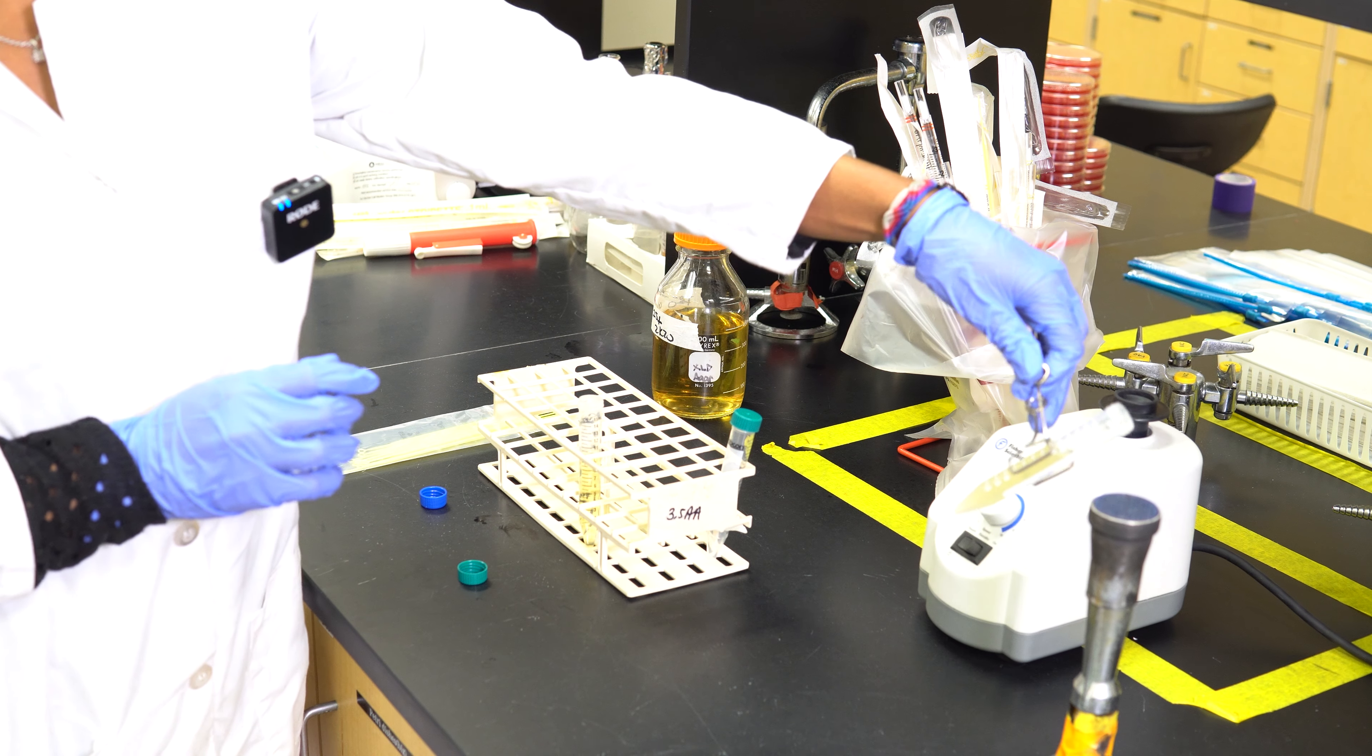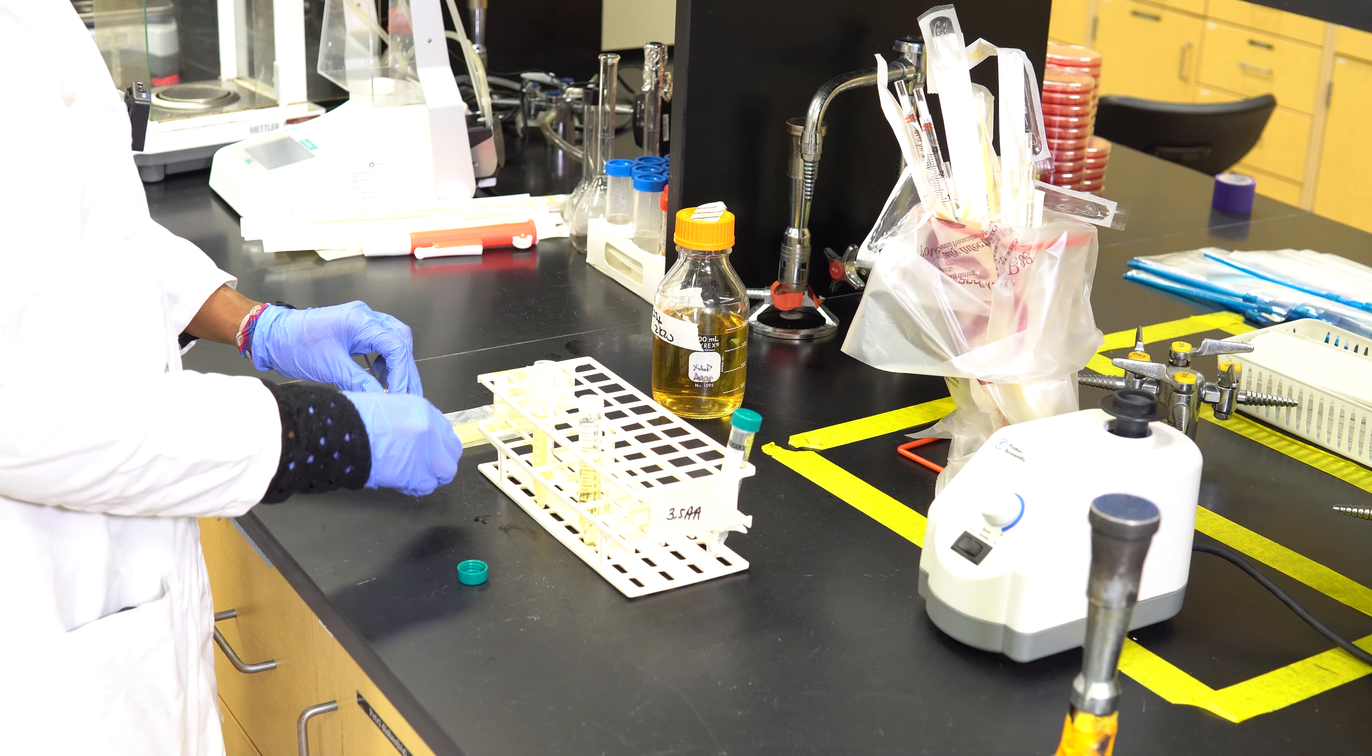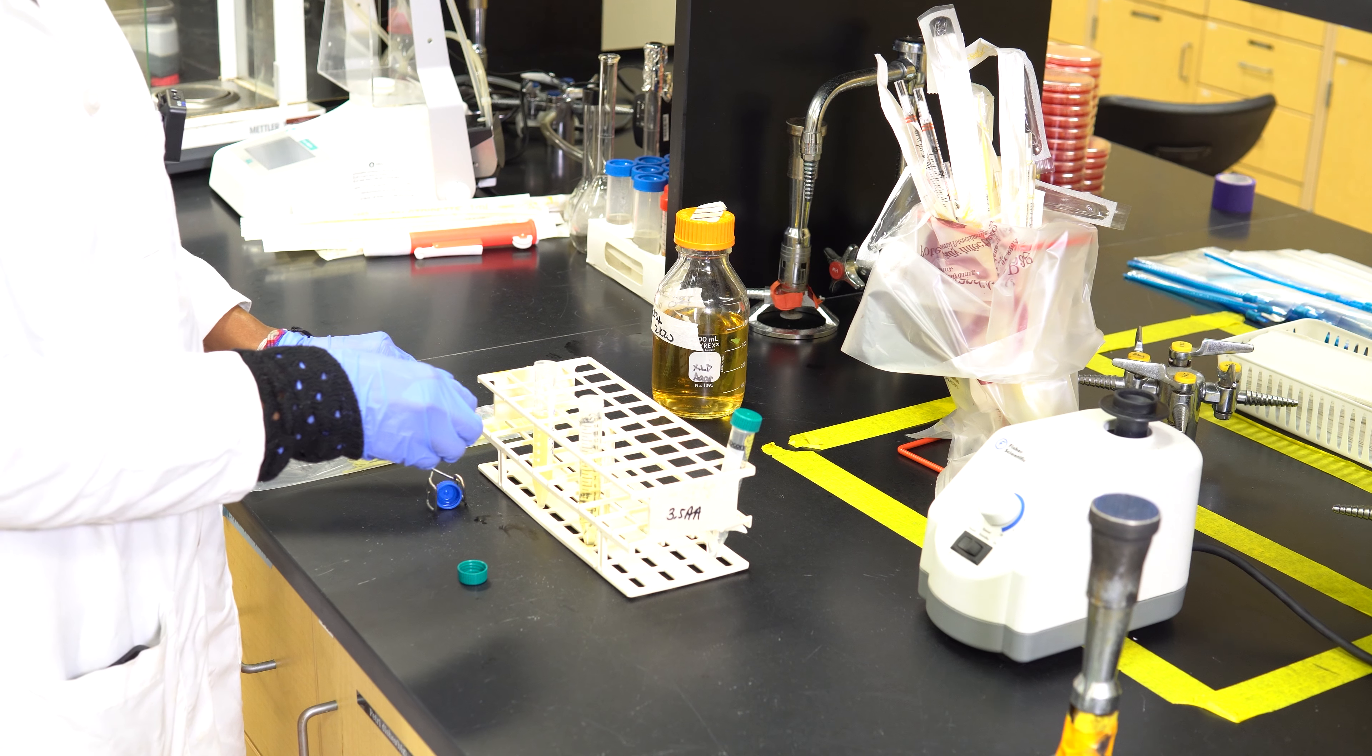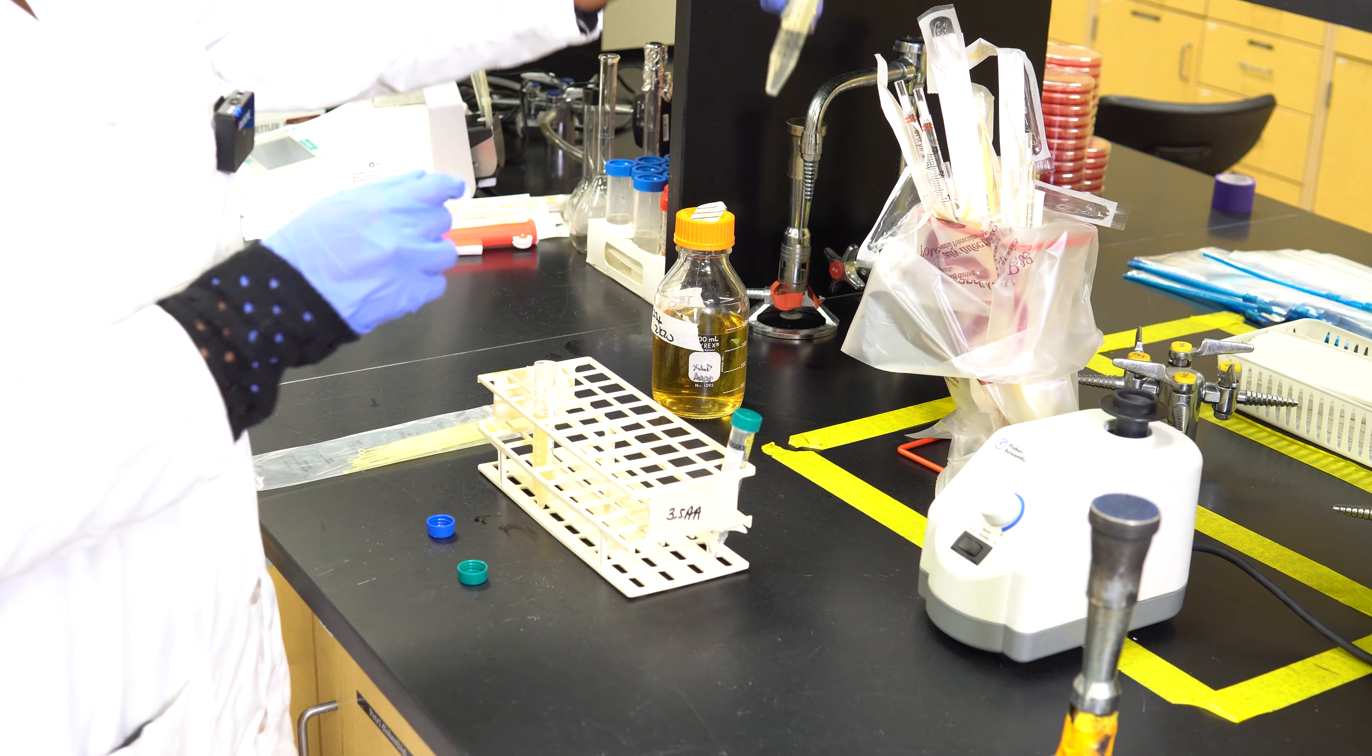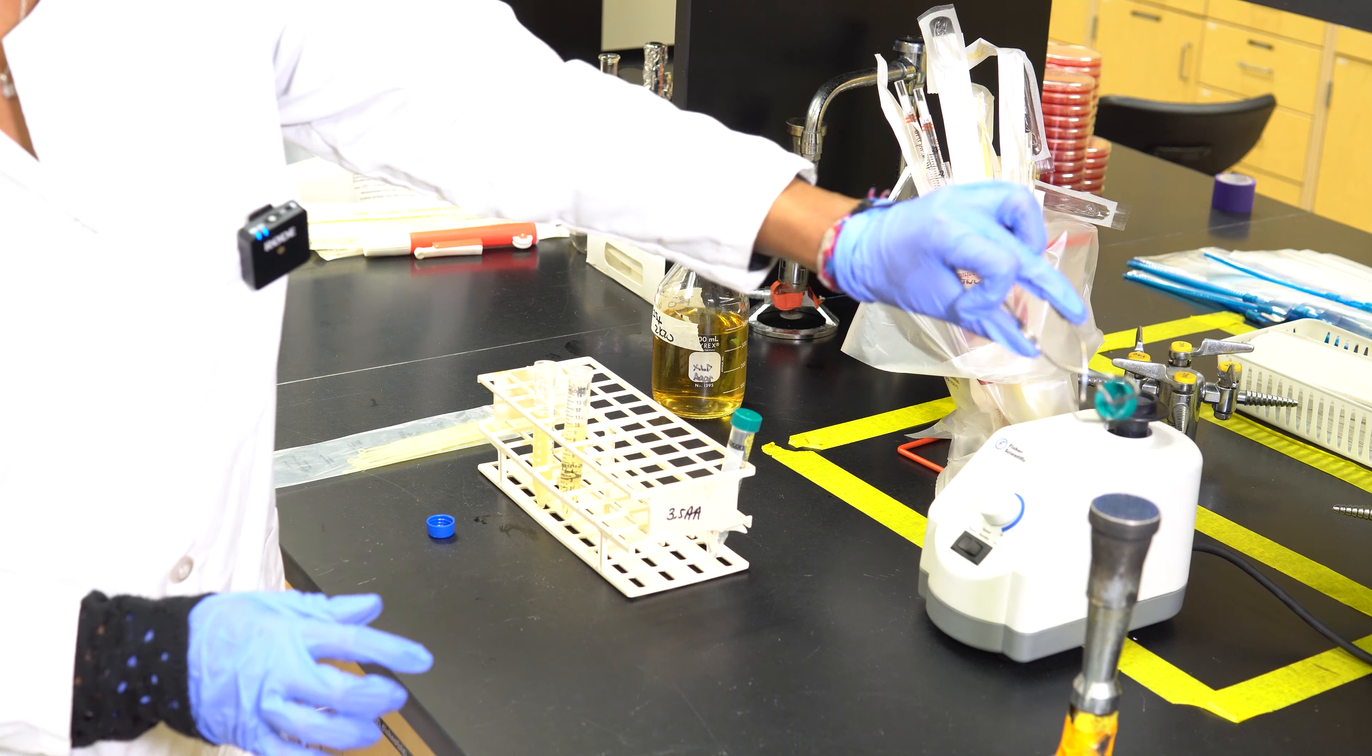The objective of this lab is to learn how to grow up cells for a microbiological study. The materials needed are the microorganism, test tube filled with fresh TSB, test tube rack, disposable loop, vortexer, and a Bunsen burner.